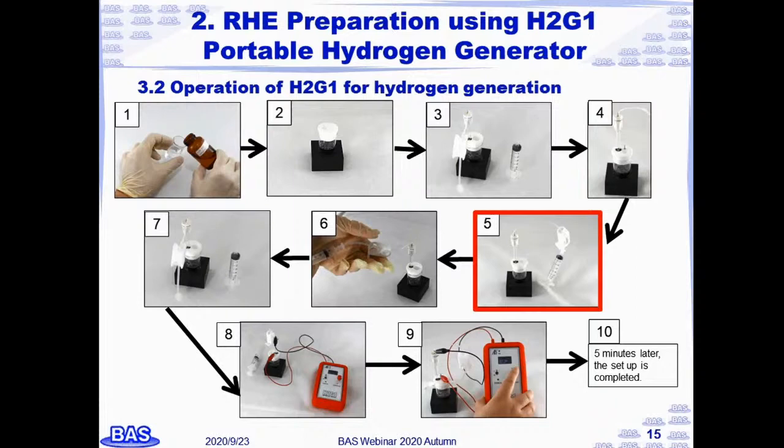Push the disposable syringe to the top and connect the disposable syringe with a silicone tube. Pull the disposable syringe to pull up the 1.2 molar hydrochloric acid solution into the silicone tube, and nip the silicone tube in the middle of the solution with the tubing clamp. Take care of air bubbles. Take out the disposable syringe. The solution won't spill out.